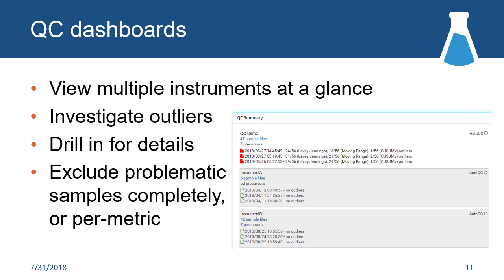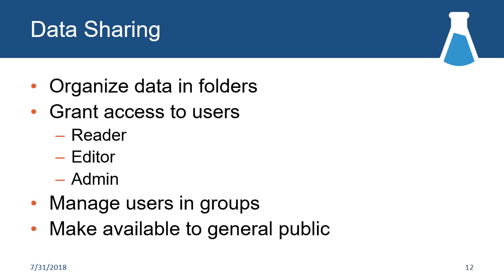You want to be looking at, okay, how's the QTOF doing, or looking at them individually. So we have the summary reports where you can see something is red and angry up in this top one, and these others are looking happy at the moment. Again, we'll be looking at more details with specific examples a little bit later this afternoon.